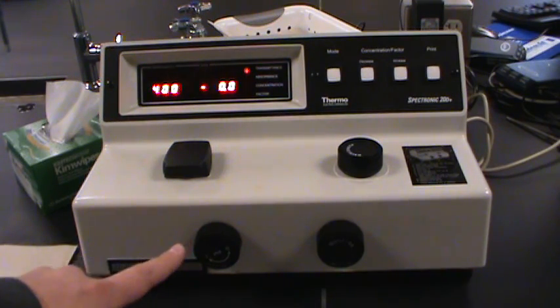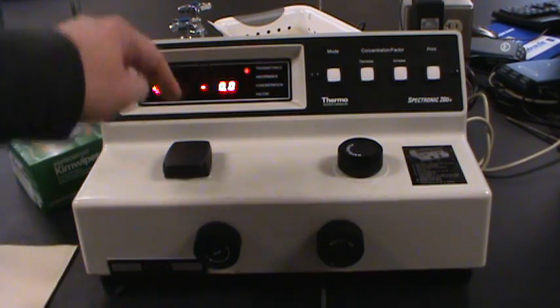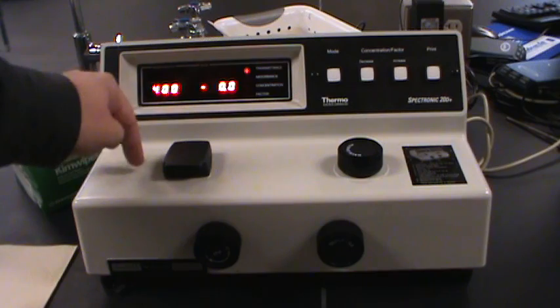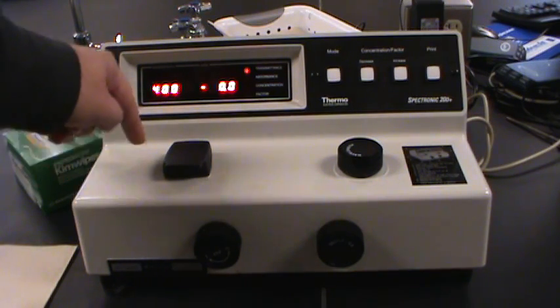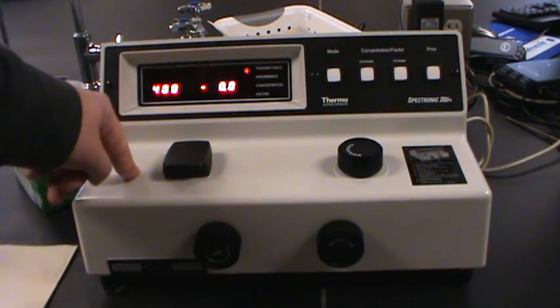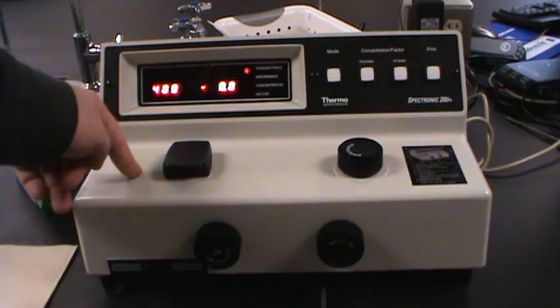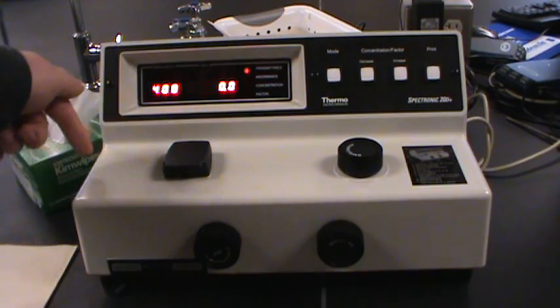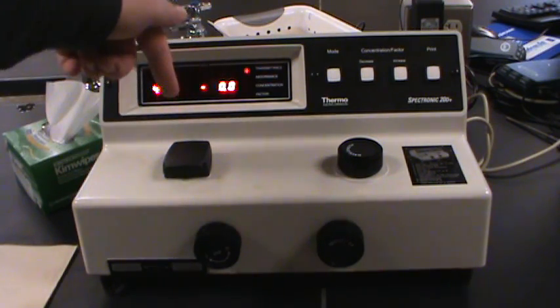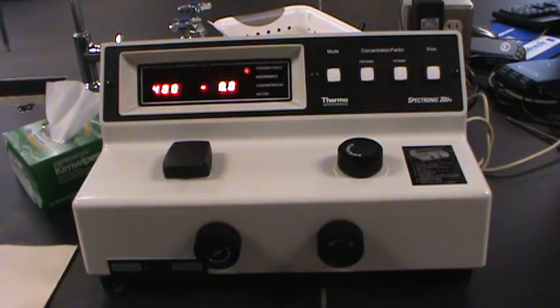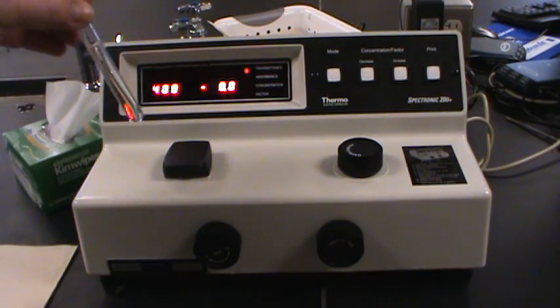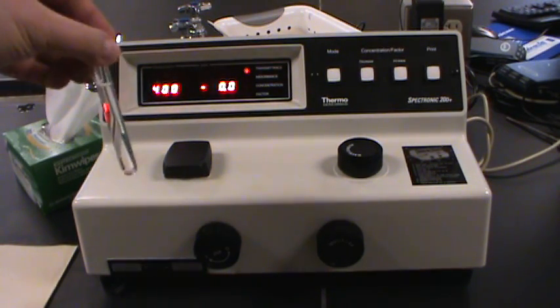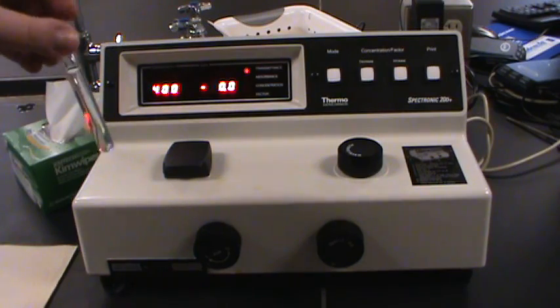So now what do we want to do? We've told the instrument what zero light getting to the detector looks like. Now we want to tell it what it looks like if all of the light is getting through to the detector. So we need a blank. For our purposes, we're just going to use a plain water test tube.